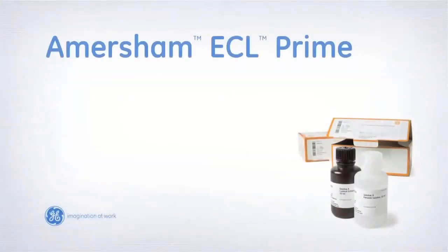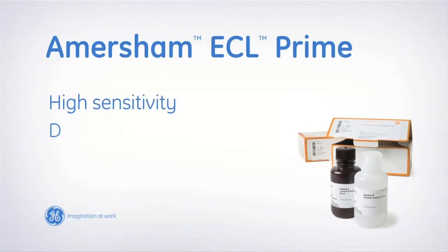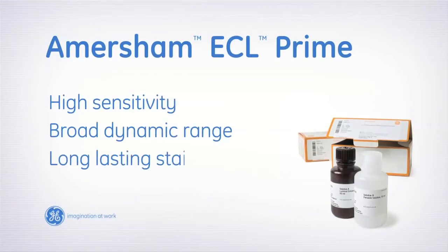ECL Prime with CCD imaging gives you high sensitivity, broad dynamic range and long lasting stable signals. For best results, remember to optimize exposure time. Follow the steps in this video and ECL Prime will give you results you have only dreamt about.